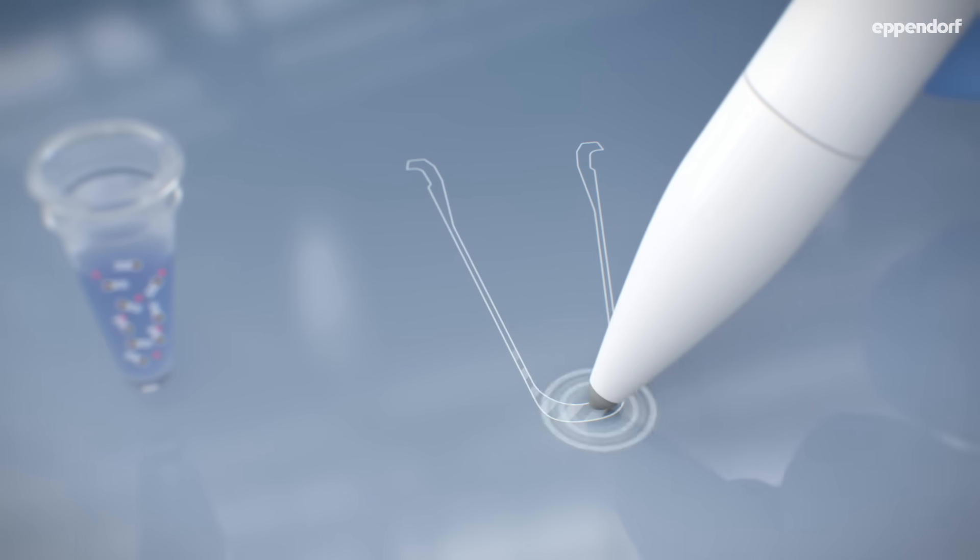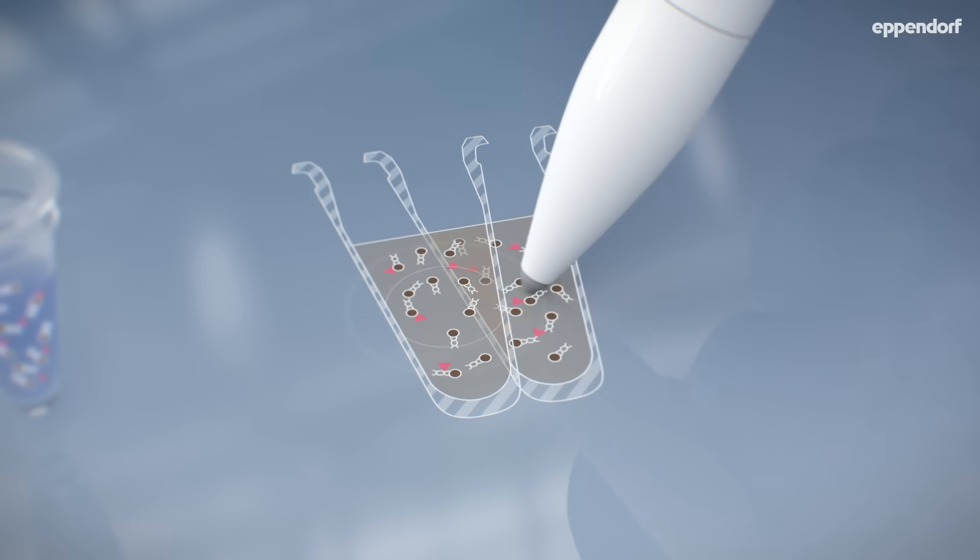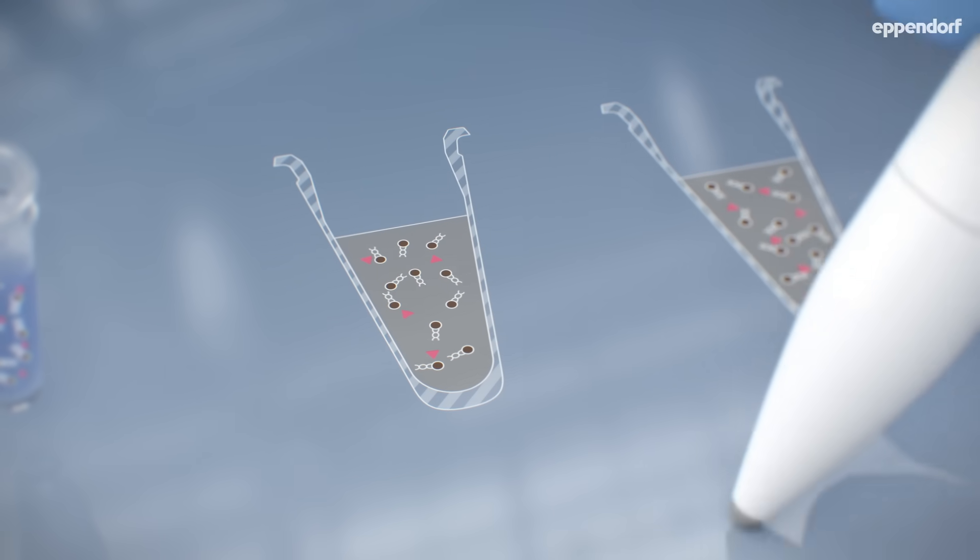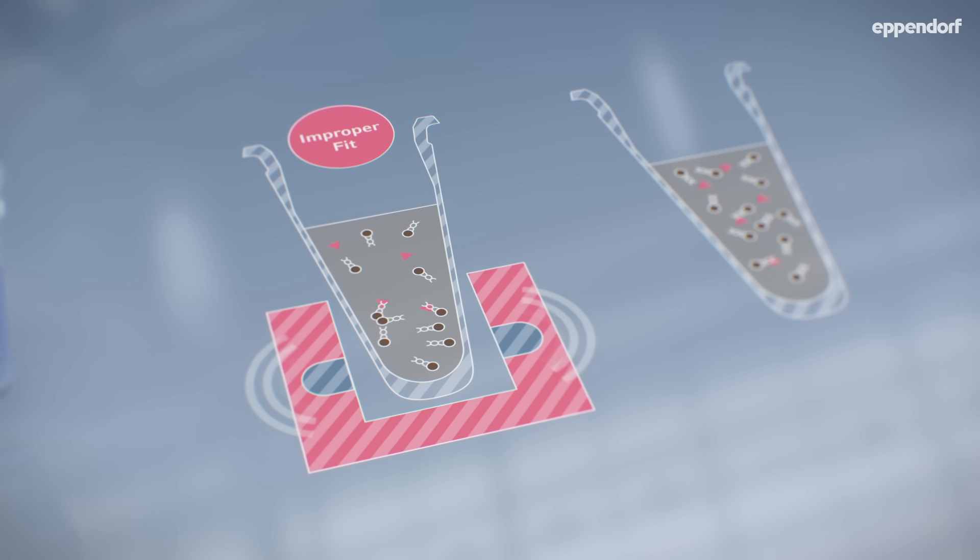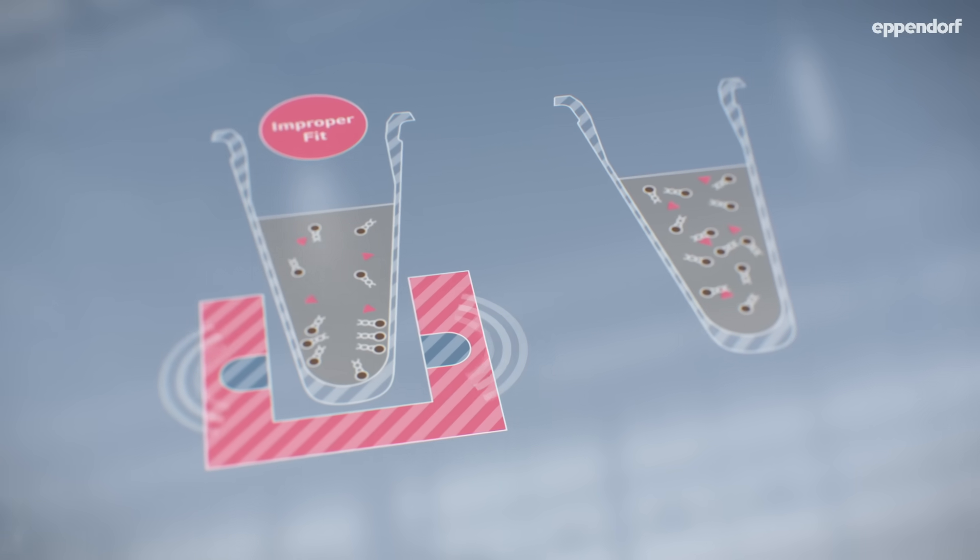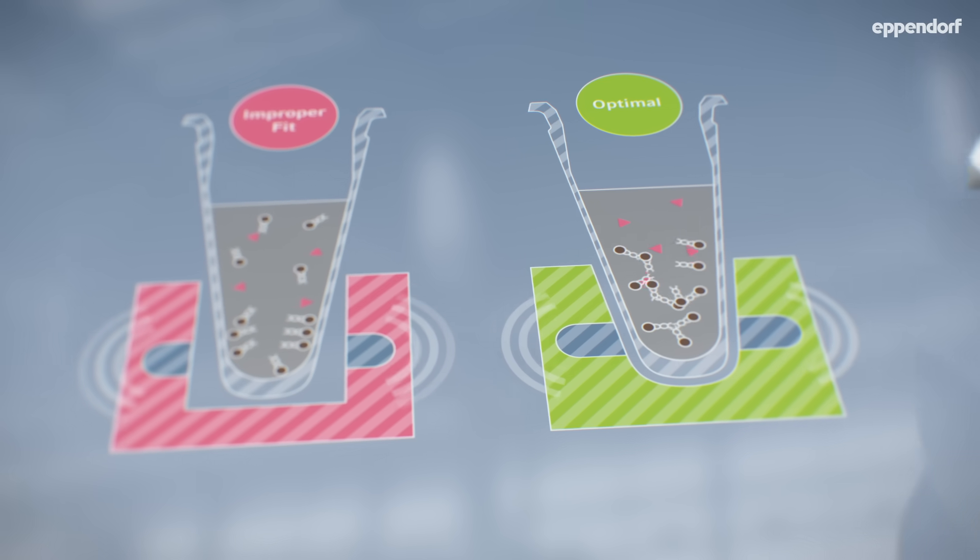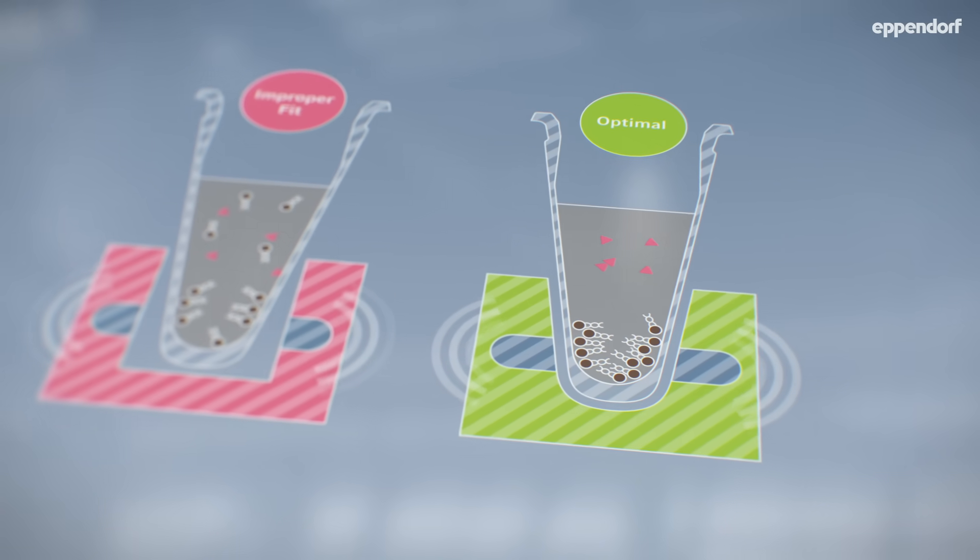Let's take a closer look. If the sample vessel does not have a good fit with a magnetic plate, some of the sample can be lost. For all of the sample to be recovered, it is important to have an optimized fit. The supernatant can then be removed without disturbing the magnetic beads.